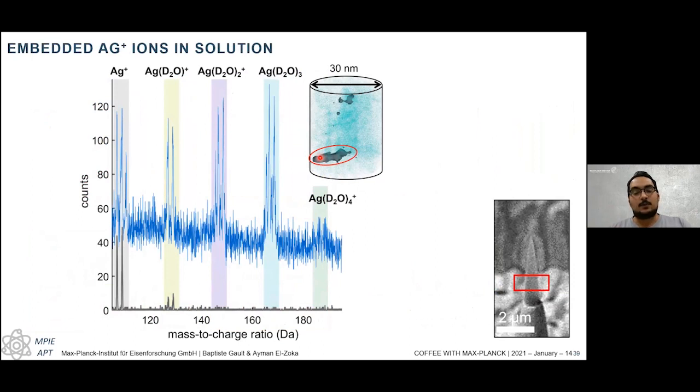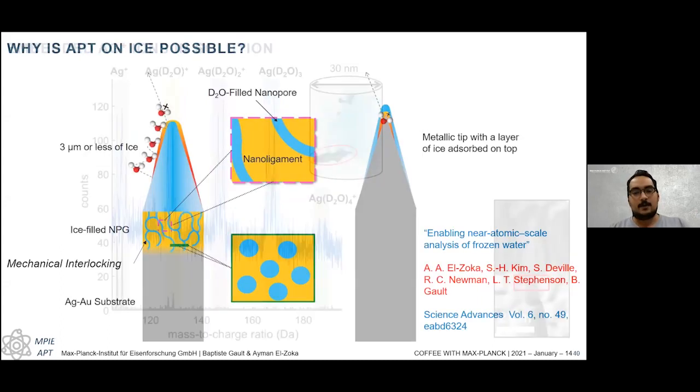And that was, again, an unprecedented observation. And it would only be enabled through this cryo-APT procedure, where you can catch the de-alloying in situ. You don't have to dry it out. You don't have to take it out of the medium and put it into a copper plating solution. You can just use water and directly freeze it and take it to the PFIB.